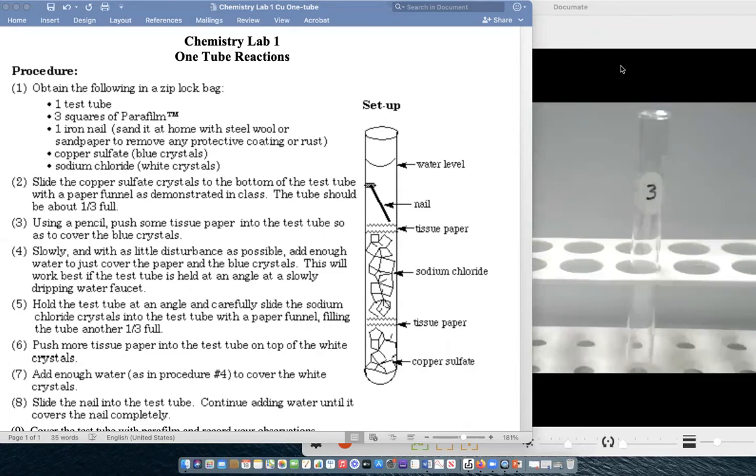In this experiment, we're going to be using some materials that you could find around the home to do an experiment that will observe physical and chemical changes. We'll look at the formulas of the substances involved, the chemical symbols used to represent them, and try to determine what's being produced as new products. It will give you a chance later on to try to separate this mixture that we're going to create and see whether or not they have indeed formed new materials by a chemical process, or have they just dissolved and perhaps formed a physical mixture which we can then re-separate at the end.